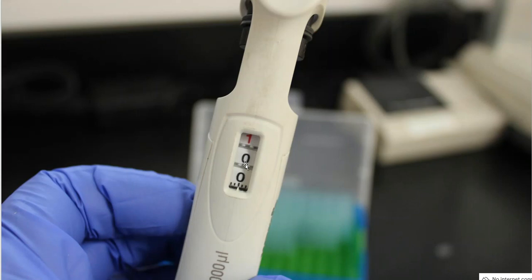So 1, 0, 0, and then that small tick mark down below is the 4th digit, which is another 0. So this really represents a 1,000. Not all micropipetter tips are represented that way. It's just the way that ours has been constructed and manufactured. In addition to that, they are student use micropipetters. They are not what we would call analytical grade micropipetters that would be used for a company.